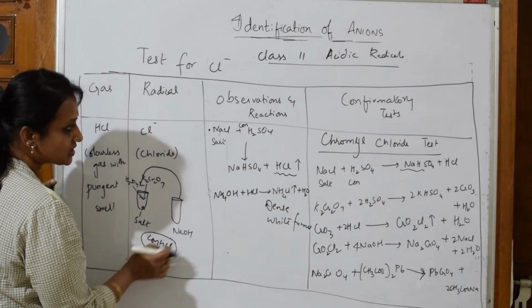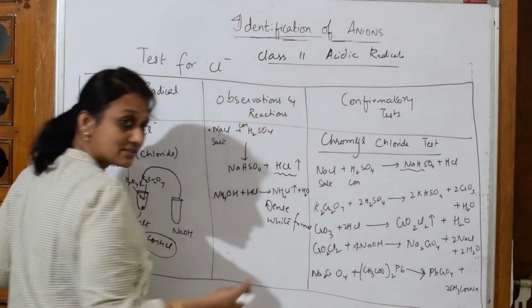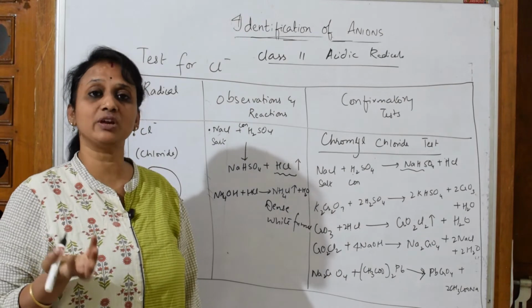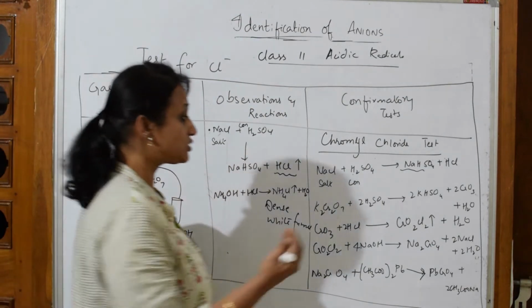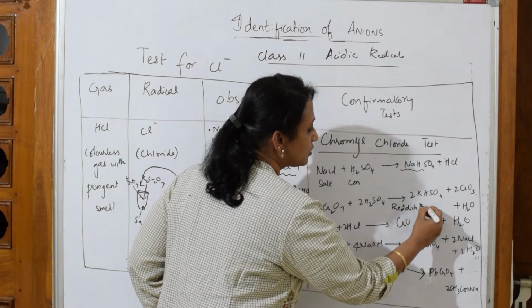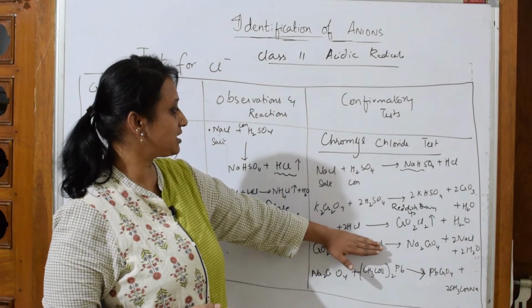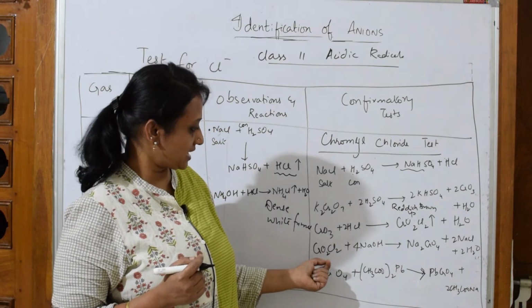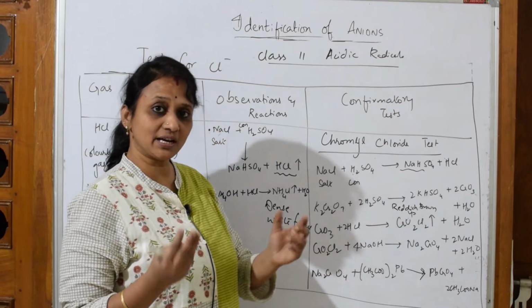It means concentrated HCl is this one. If you take NaCl as a salt here, HCl is formed here. So when you add this, it's going to form reddish vapors of chromyl chloride. As soon as you mix these two, it's going to form reddish brown vapors of chromyl chloride. Simple reaction till here, just see, done. This reddish vapor, chromyl chloride vapors, as I told you.